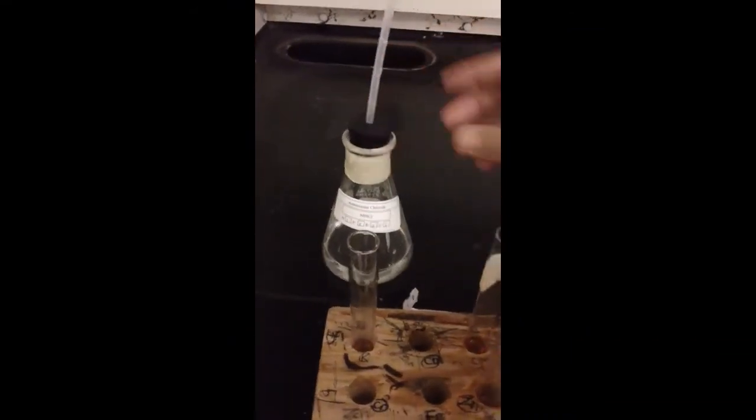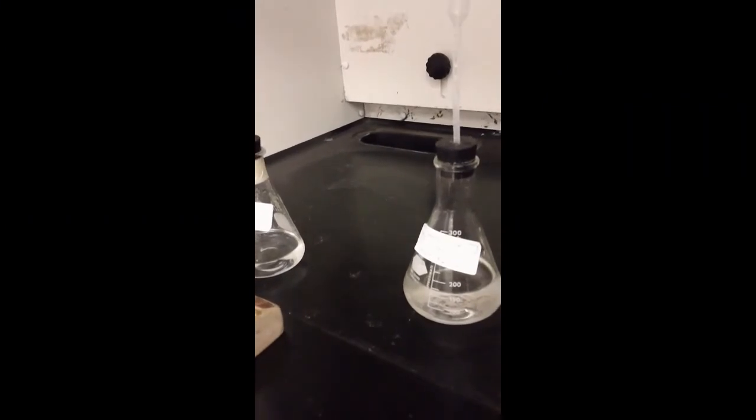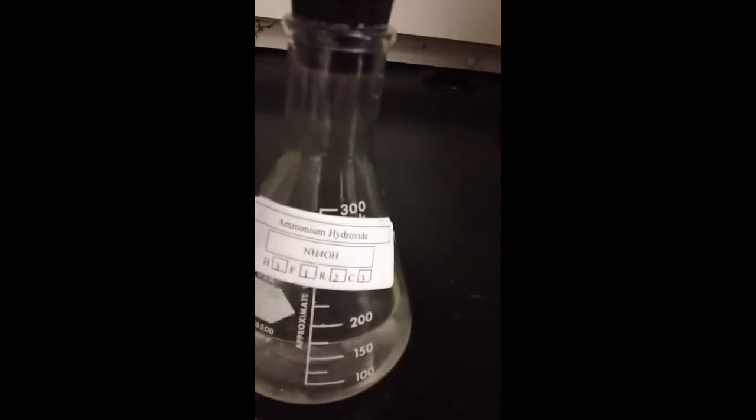Okay. Gently mix. I've got kind of like a colloid looking thing down there. Okay. So now I go to my next step, which is to add 10 drops of NH4OH. So now I'm at this one, double checking against that, against my sign. So 10 drops of this one.